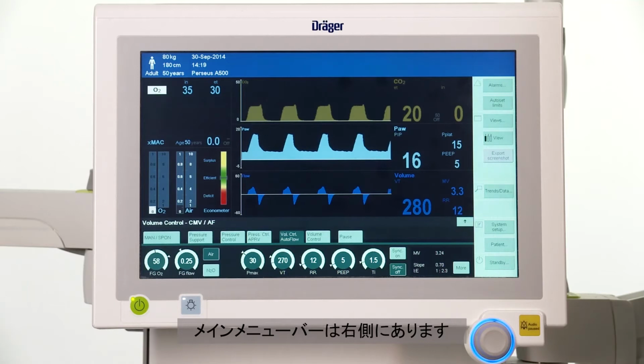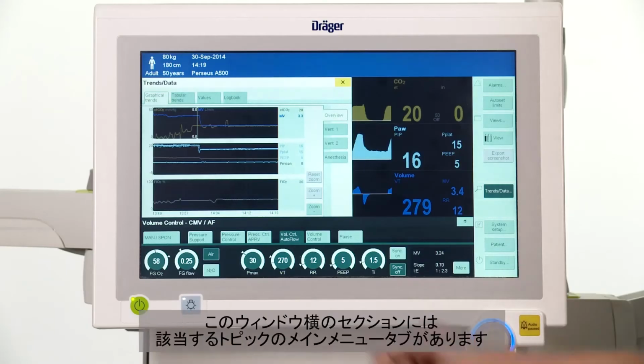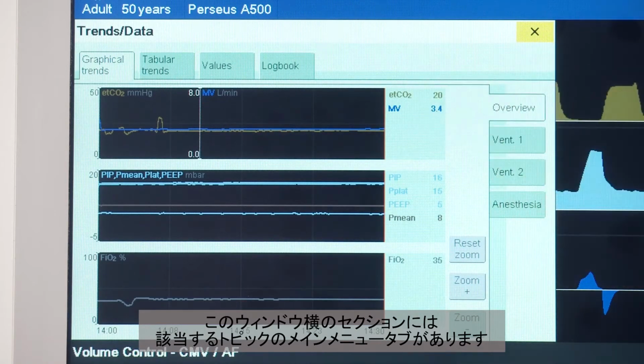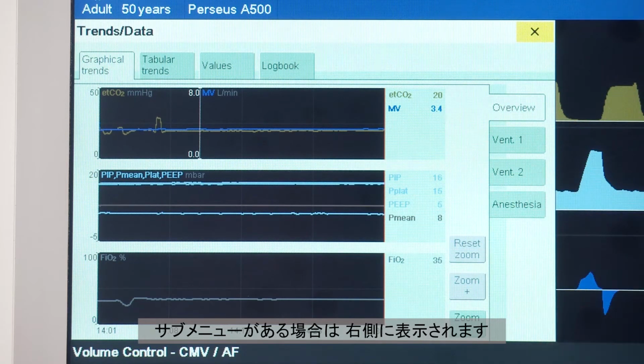The main menu bar is located on the right side. Selecting one of these buttons will open a dialog window. The horizontal section of this window contains the main menu tabs for the respective topic. Each main menu can have several sub-menus. If there are any, you will find them on the right side.